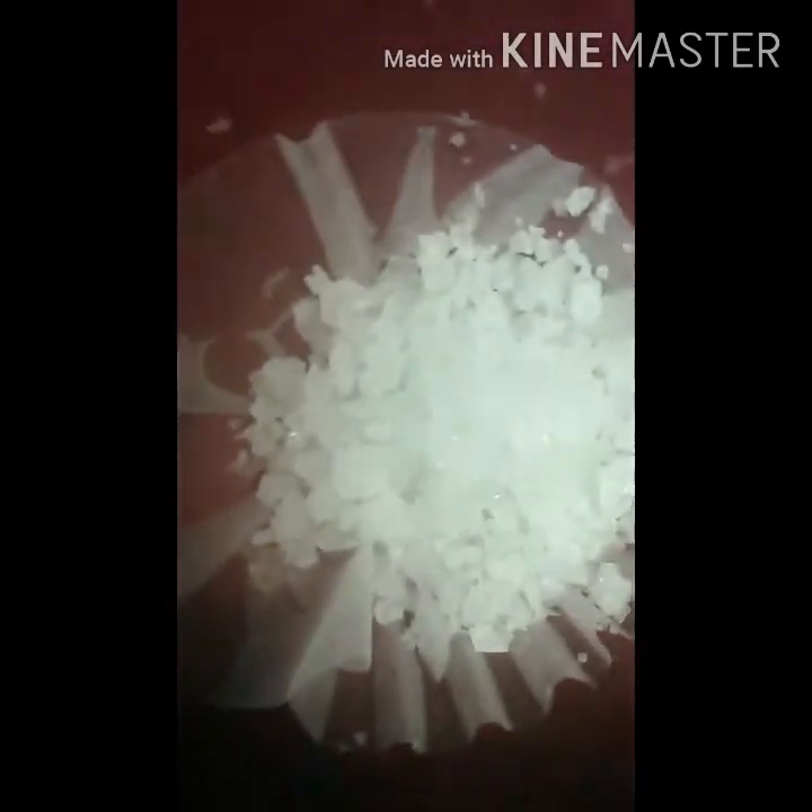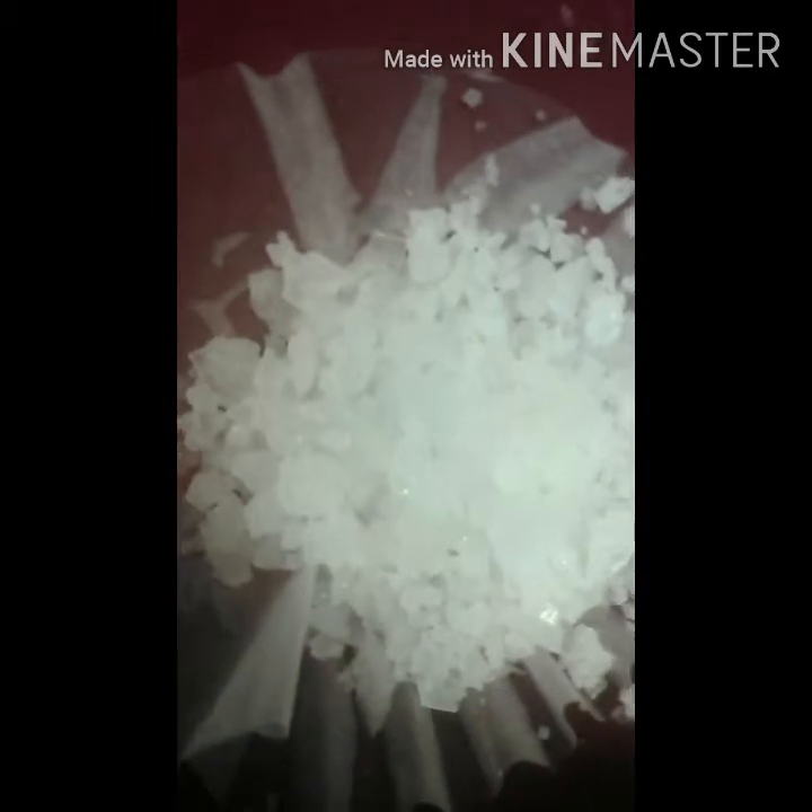So here's what they look like after they've sat for a while and been filtered — this is after the first filtering. They have a pretty nice crystal pattern. I'm not sure what the crystal system is exactly; I'm guessing it's hexagonal or rectangular. Anyway, I'm going to put them in water again, re-dissolve and re-crystallize them to keep purifying and to get the acid out.